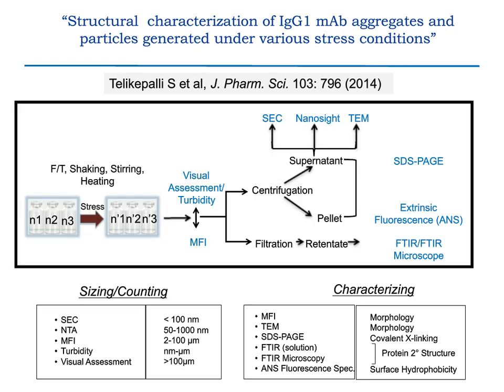This work highlights the need, shown on the bottom of the slide, to not only size and count particles, but also to better characterize the particles in terms of the morphology, in terms of the structure of the protein entrapped within the particles. And so this work is a case study looking at a variety of different analytical tools shown in the flow sheet in the middle of the slide, after we expose an antibody solution to different stresses, either freeze-thaw, shaking, stirring, or heating.